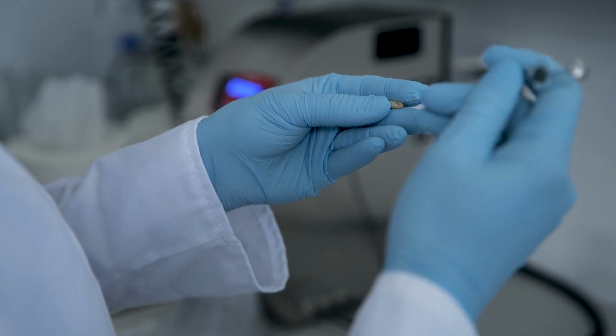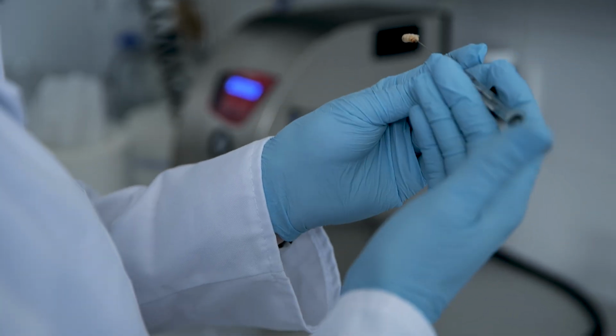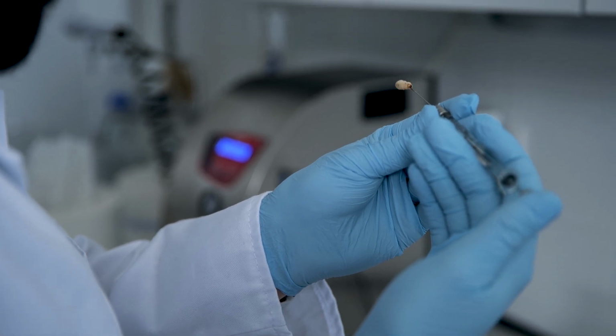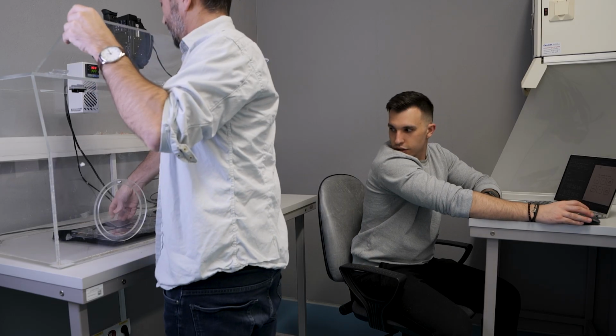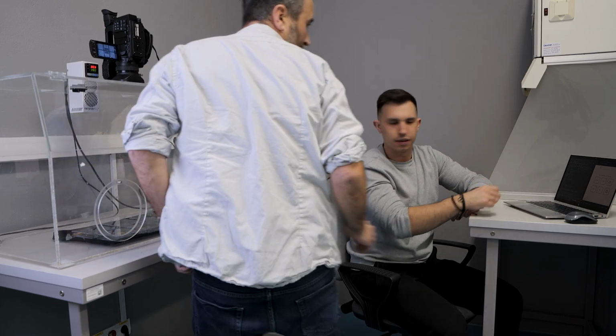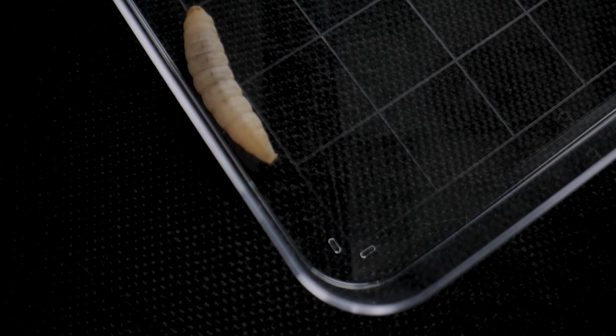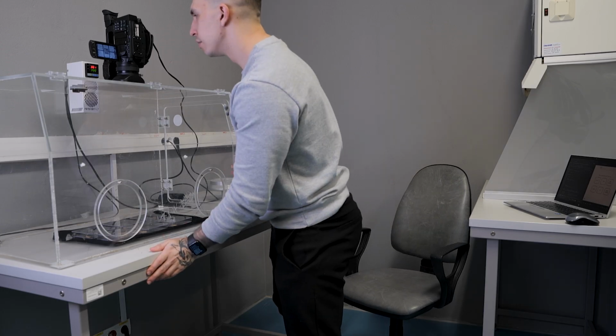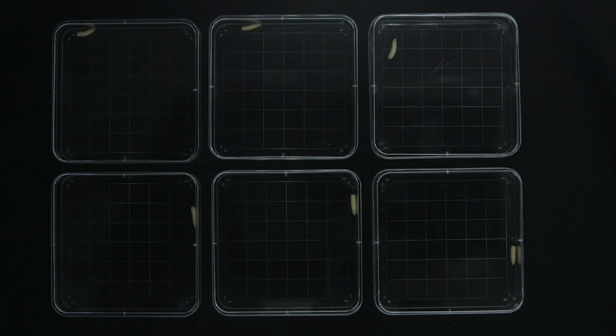But what can we learn from these changes? And how can this tiny larval sacrifice be useful to us? In this quest, our Noise&Patterns team worked hand-in-hand with scientists from Wrocław Medical University. To track larval movement, the little volunteers needed to be filmed. Since they don't like light very much, high-sensitivity cameras seem to be the best choice.